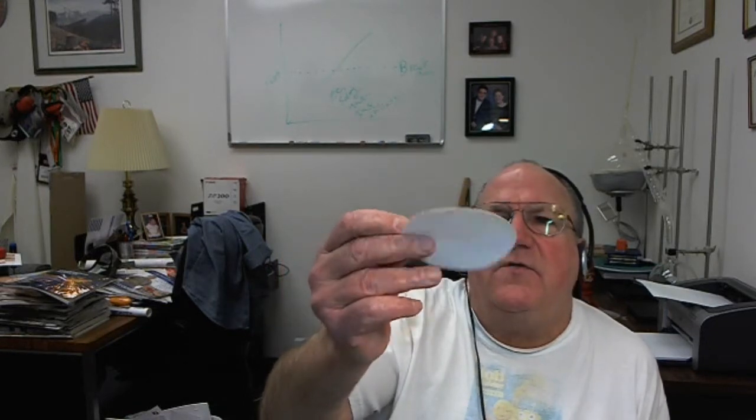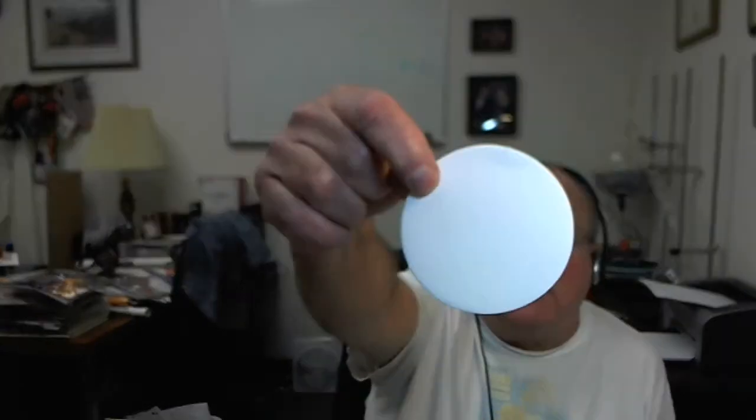It is entirely possible, depending on how you define your terms — as always. This is a piece of standard filter paper, Whatman filter paper. It is a felting material. If you get a piece and hold it up to the light you can see fibers going through it. Felting is where you take a bunch of fibers and mash them together to make cloth.